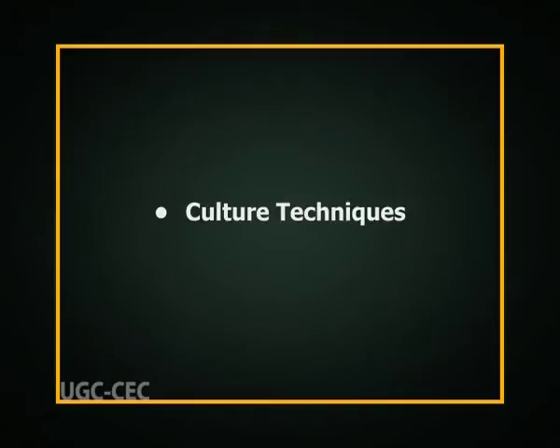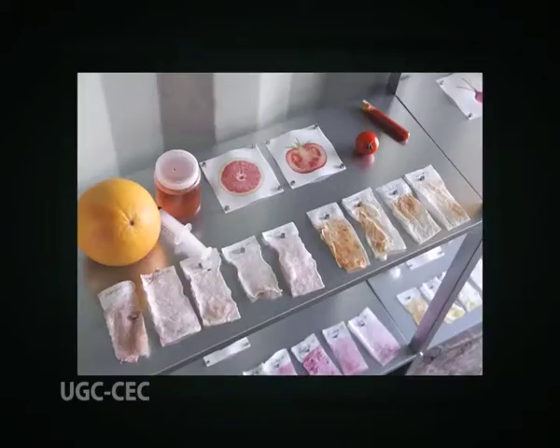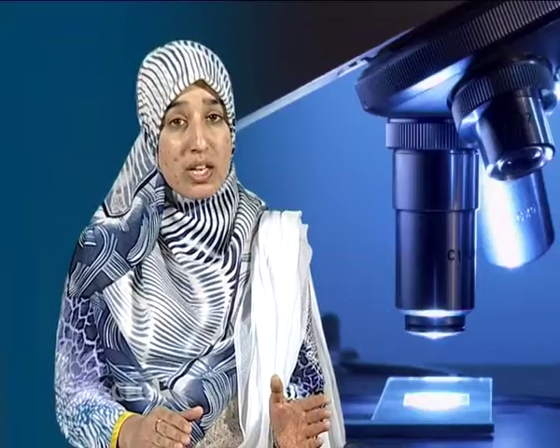Now friends, let us discuss some common cultural techniques that are used in food microbiology. In food microbiology, the examination of foods for the presence, types and number of microbes and their products is essential. However, as I already said, none of the single methods allows the determination of exact numbers of microorganisms in a food product because every method has certain inherent limitations associated with its use. Here, we will discuss some common cultural methods that are employed.